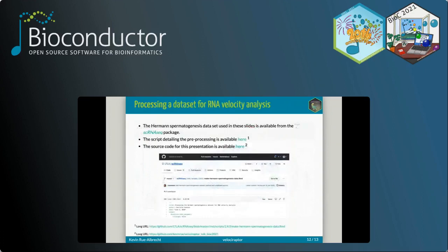I will conclude this presentation with links to the dataset and scripts that were used to generate those slides. We used the Hermann spermatogenesis dataset available pre-processed by Charlotte Soneson and available from the scRNAseq package. The script detailing the pre-processing is available from the first GitHub link, and the source code of the slides that I am presenting right now is available from the second GitHub link, including code chunks for the processing and visualization steps that I have demonstrated.